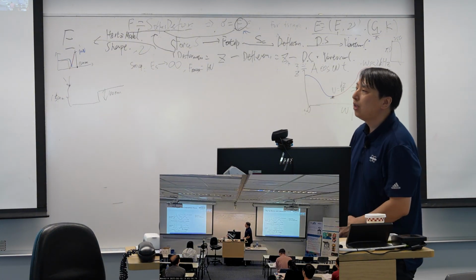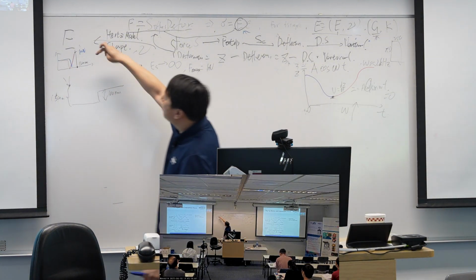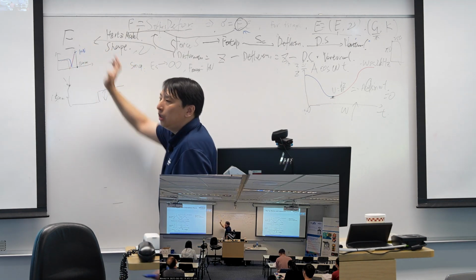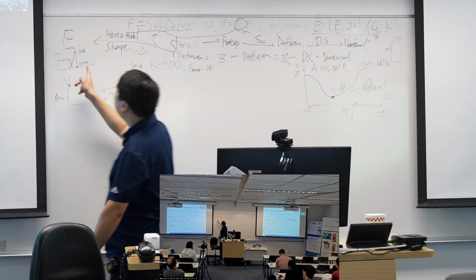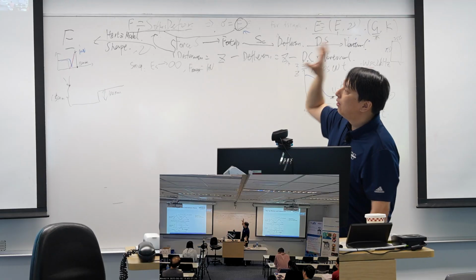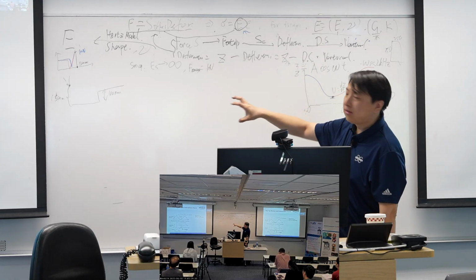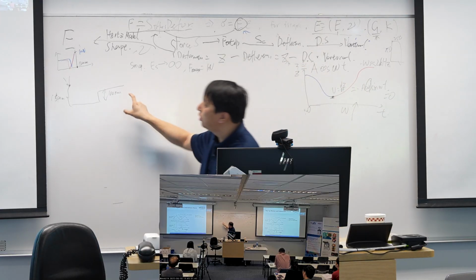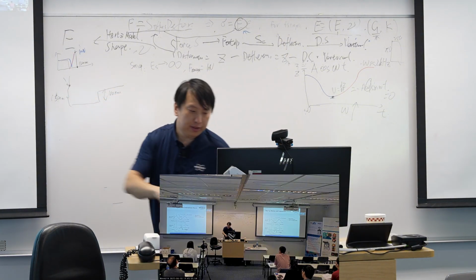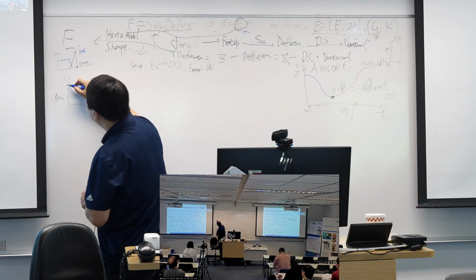That means once my probe reaches the maximum force, it will retract 150 nanometers. That's my setup. Then I use this to try to capture the morphology of my samples. So my probe is somewhere here. It will move down.